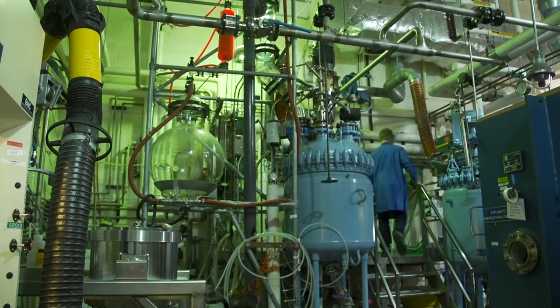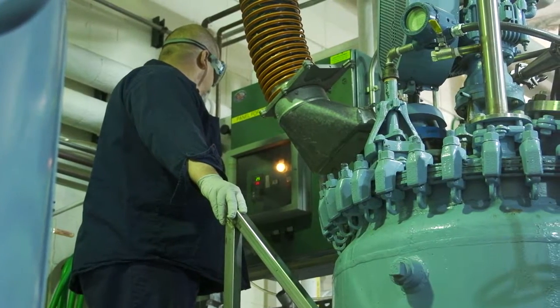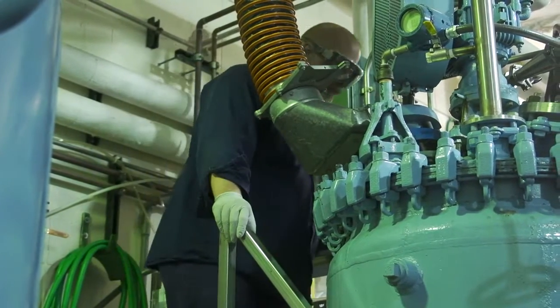QC is involved in the whole process, from raw materials through release of manufactured materials and inventory. In fact, throughout manufacturing, in-process controls assure that criteria are met before moving on to the next step in the process.